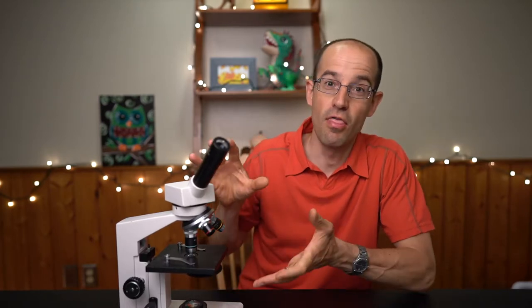Welcome to Lightbulb Biology. I'm Mr. Korver and today we are talking about the microscope.